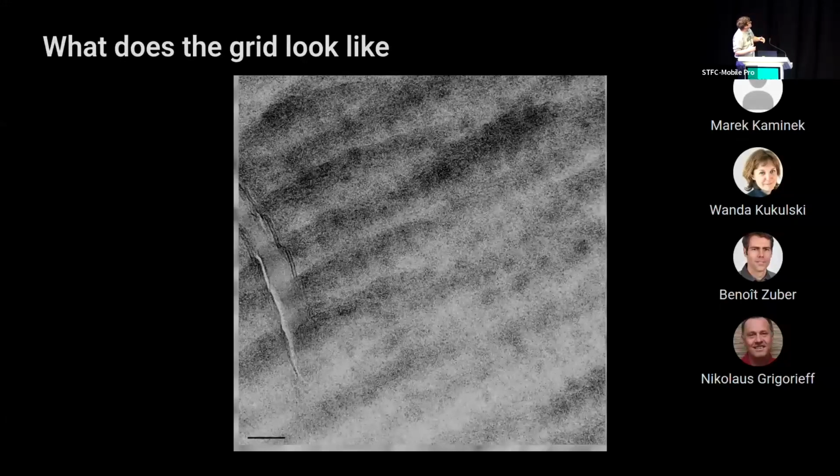And one thing you might notice is that in this micrograph there's a membrane, and connected to these aberrations, you can see the membrane sometimes seems to be torn apart. And I think this is the main reason why people have not done this as much as we should, because in FIB that doesn't happen, right? In FIB, the ultrastructure is perfectly preserved and it's all beautiful. But what we were wondering is, what about the high resolution information? How does that compare? Is that maybe also gone, or is it maybe well preserved and we could actually use these slices?